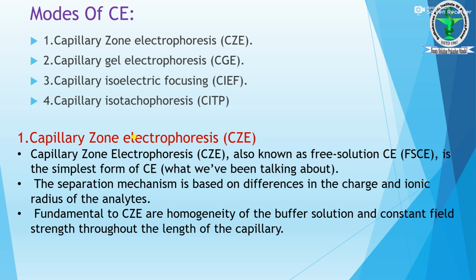Then the modes of capillary electrophoresis. Which kinds of capillary electrophoresis are there, and how does capillary electrophoresis take place? That is another point. First, capillary zone electrophoresis (CZE).